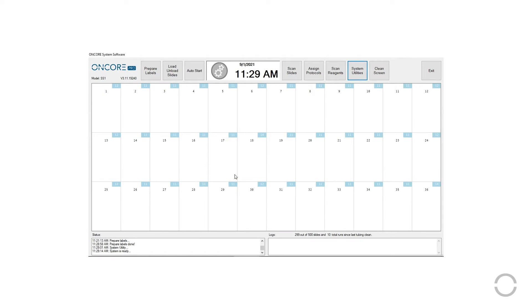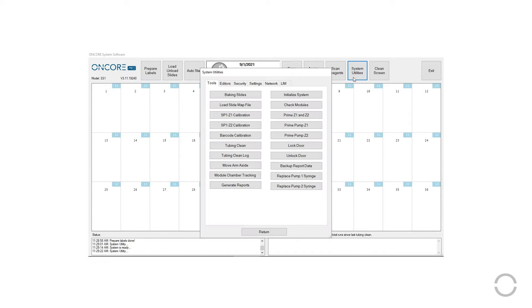Protocols in the Encore Pro software are associated with reagents. To create a whole new protocol, you will first want to make sure your desired reagent is in the reagent manager.